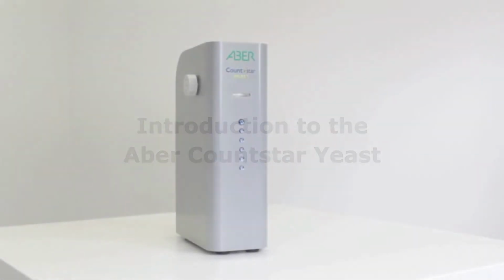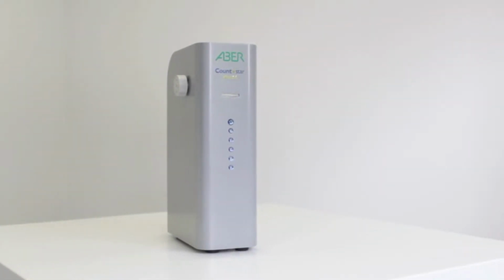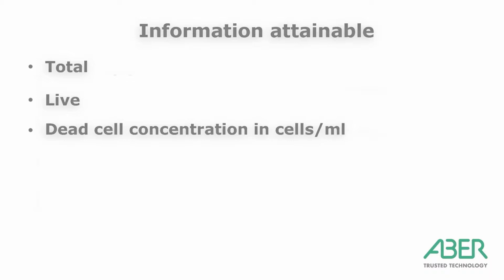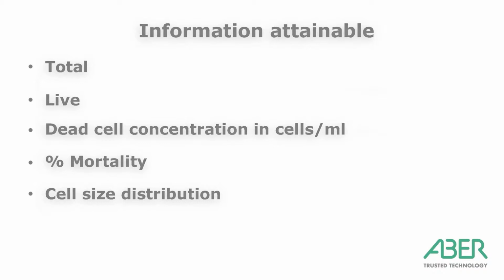The CountStar Yeast is an automated cell counter for analysing yeast samples. It gives users a variety of information such as total, live and dead cell concentration in cells per mil, along with percent mortality, cell size distribution and aggregation within a sample.